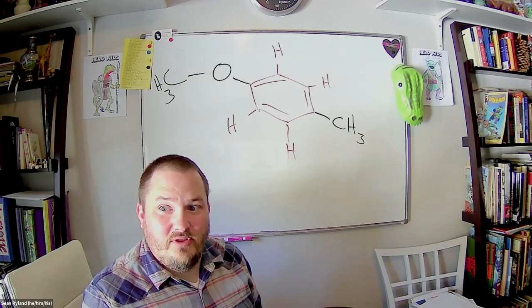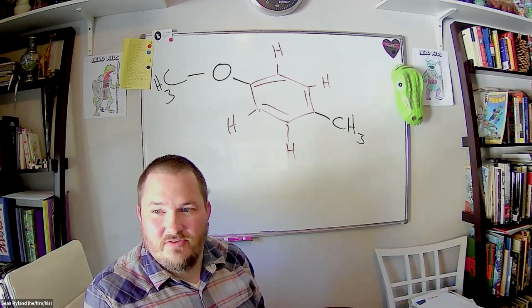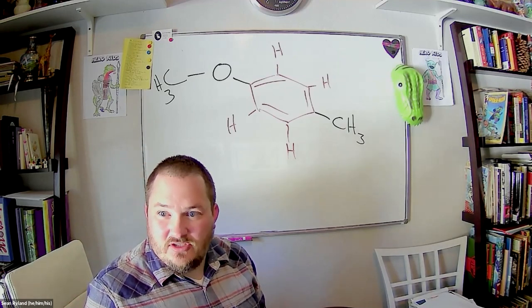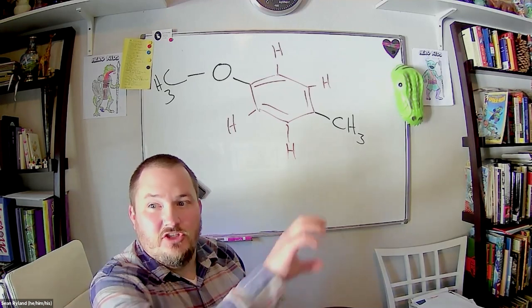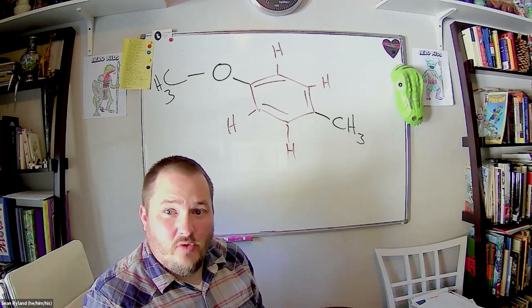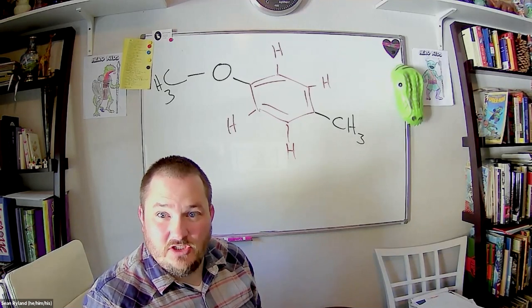So it still has its blind spots. And that's still a reason why we look at all three of these pieces of information. No one instrument can completely answer these questions. You have to look at them in conjunction with each other, and you have to pay attention to what the blind spots and the strengths of each of them are.